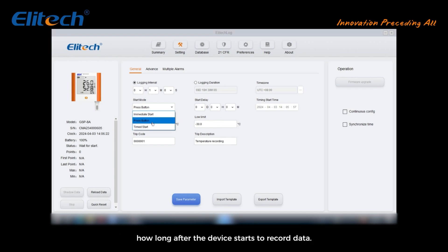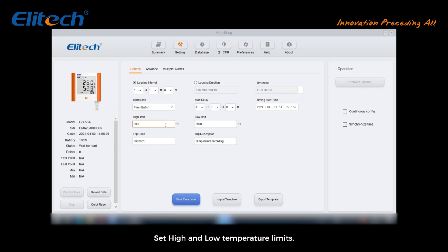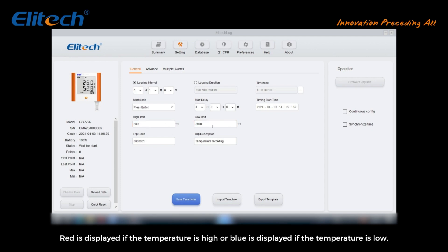Time start: you need to set the start time. Set high and low temperature limits. After exceeding, it will alarm while in the exported data document red is displayed if the temperature is high or blue is displayed if the temperature is low.